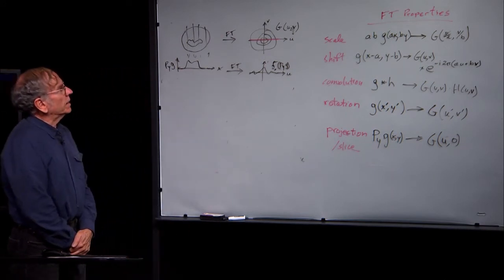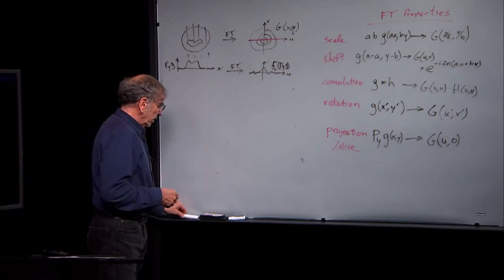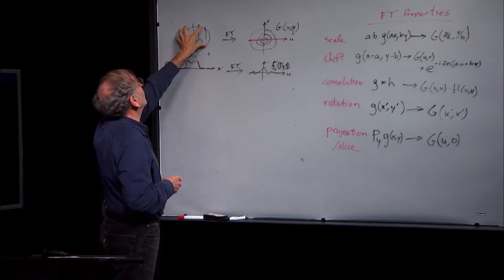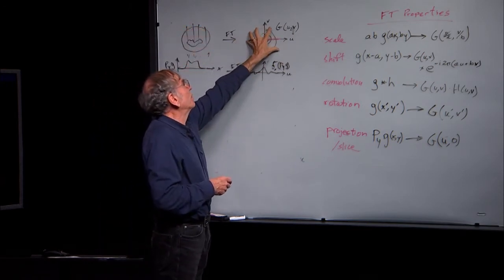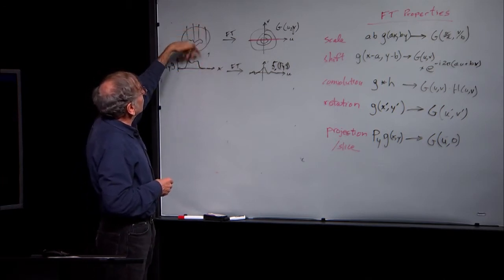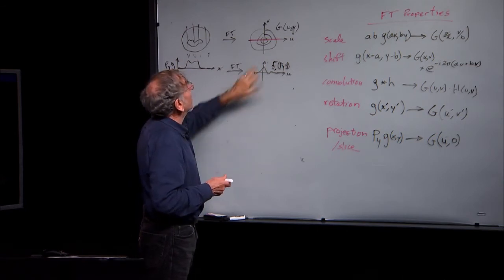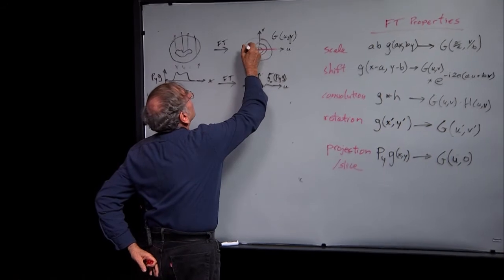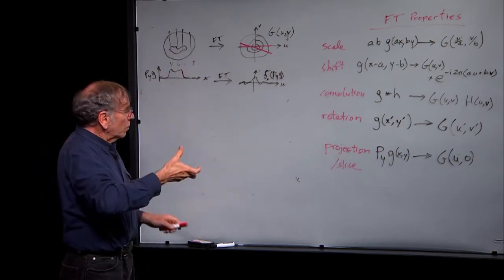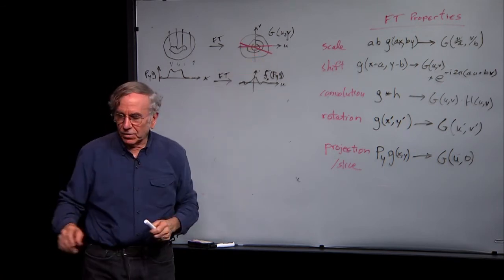Now, this is not all that interesting except when we combine it with the rotation property. So what the rotation property says is, of course, we can imagine rotating the person inside a CAT scan machine. So you rotate the person a little bit. Of course, we know that that will rotate the Fourier transform a little bit. We again do this projection along the y-axis, but we'll get a slightly different thing because we're projecting through the rotated person. We get this 1D Fourier transform, but we now know that we've rotated the Fourier transform. And so if we were to insert the new slice, the slice would be at a different angle, which represents the angle by which we rotated everything. And so if we rotate through all possible angles, we actually have a way to fill in all possible pixels in that two-dimensional distribution.